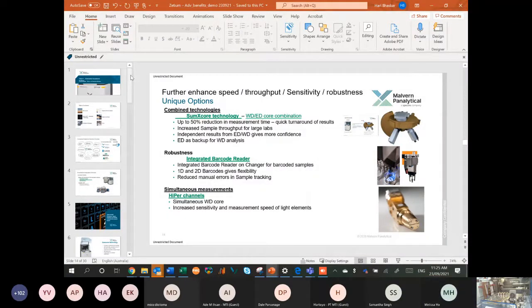I would normally not recommend preparing the pellets without the cellulose binder, and this is probably the main reason why you are having trouble making pressed pellets, and also the reason that you will have breakage and the samples falling inside the system, especially for mineral samples or ore samples. The best practice is to have a small amount of binder so that you get a nice and solid pellet.